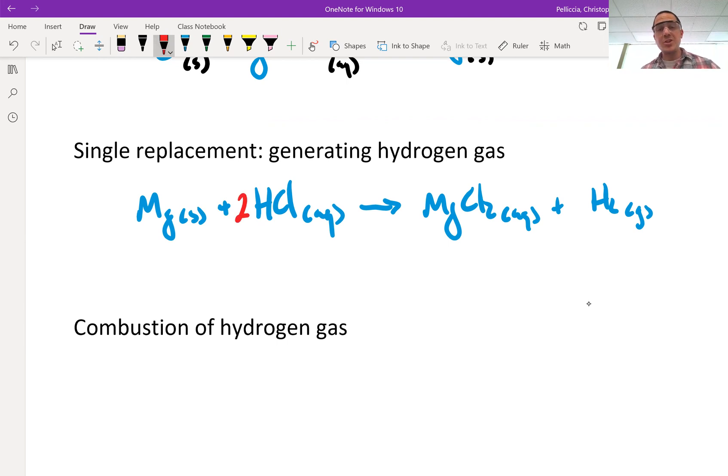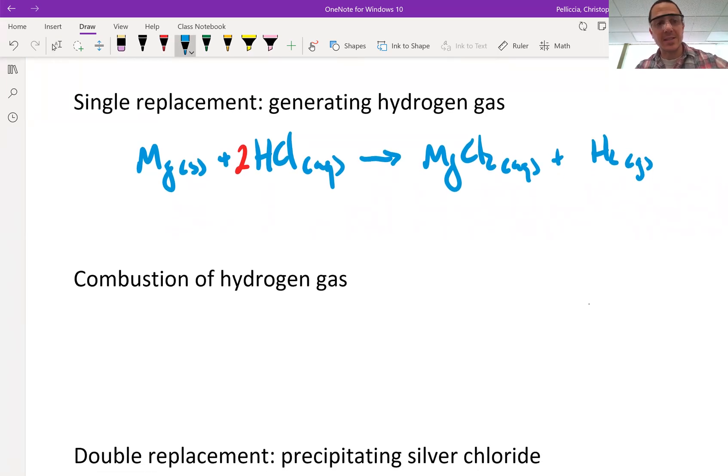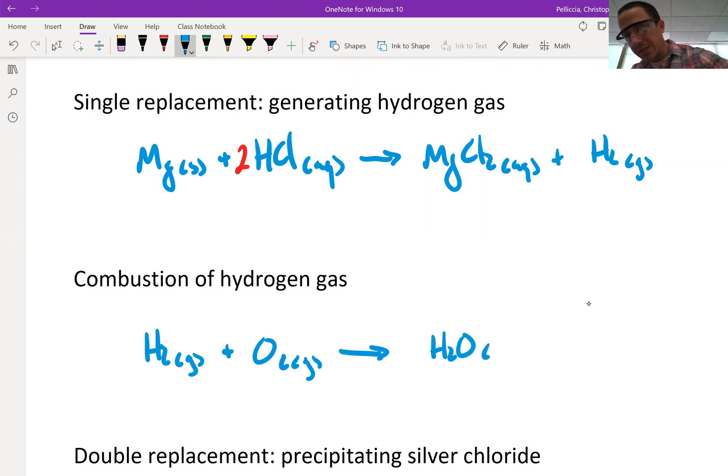Then I combusted that hydrogen gas. Combustion reaction is a fuel plus oxygen gas, yielding the product. In this case, just water vapor. Two there and two there. Of course, the second, maybe more exciting product of this is a substantial amount of energy.